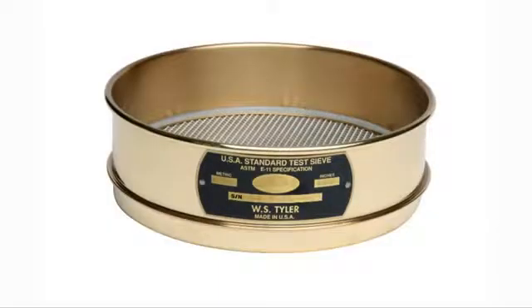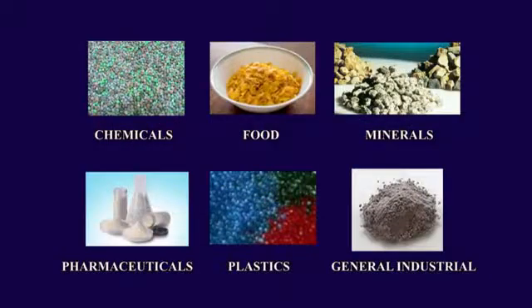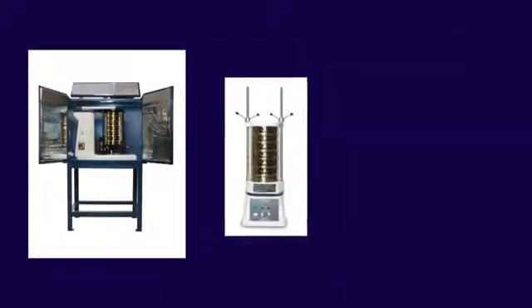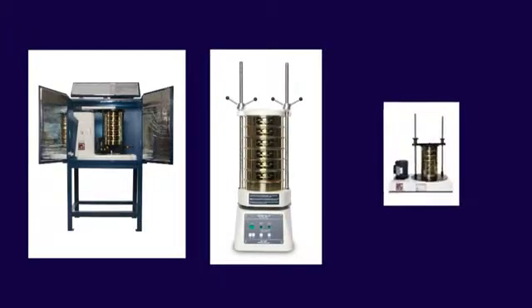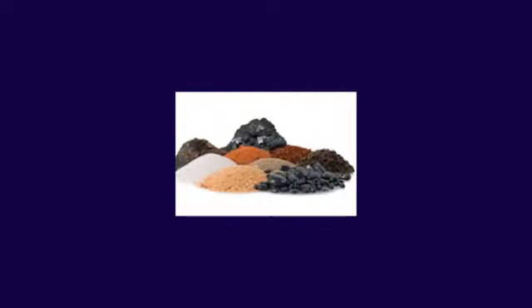Despite technology changing so rapidly, the test sieve remains a cost-effective and precise measuring instrument for dry, non-agglomerating particles. Test sieve analysis is widely used for quality control in many industries worldwide. The test sieving process is a simple and common practice to measure particle size in dry, relatively free-flowing materials. Particle distribution data is then used to analyze material size.